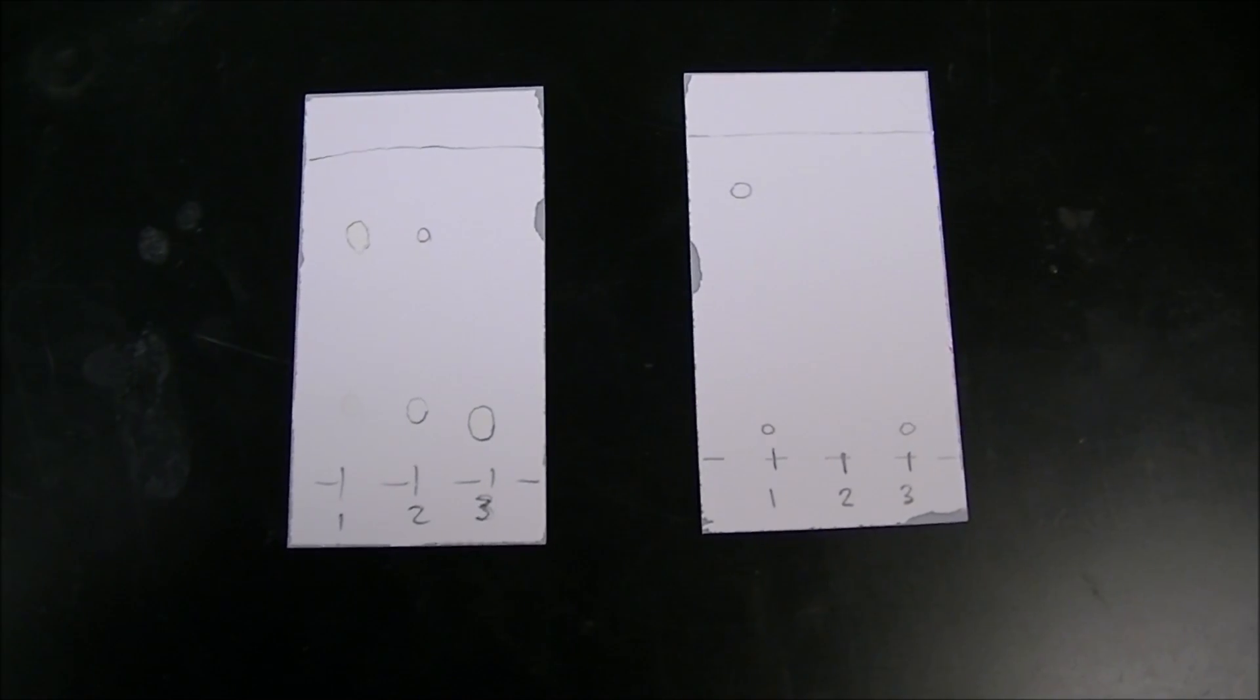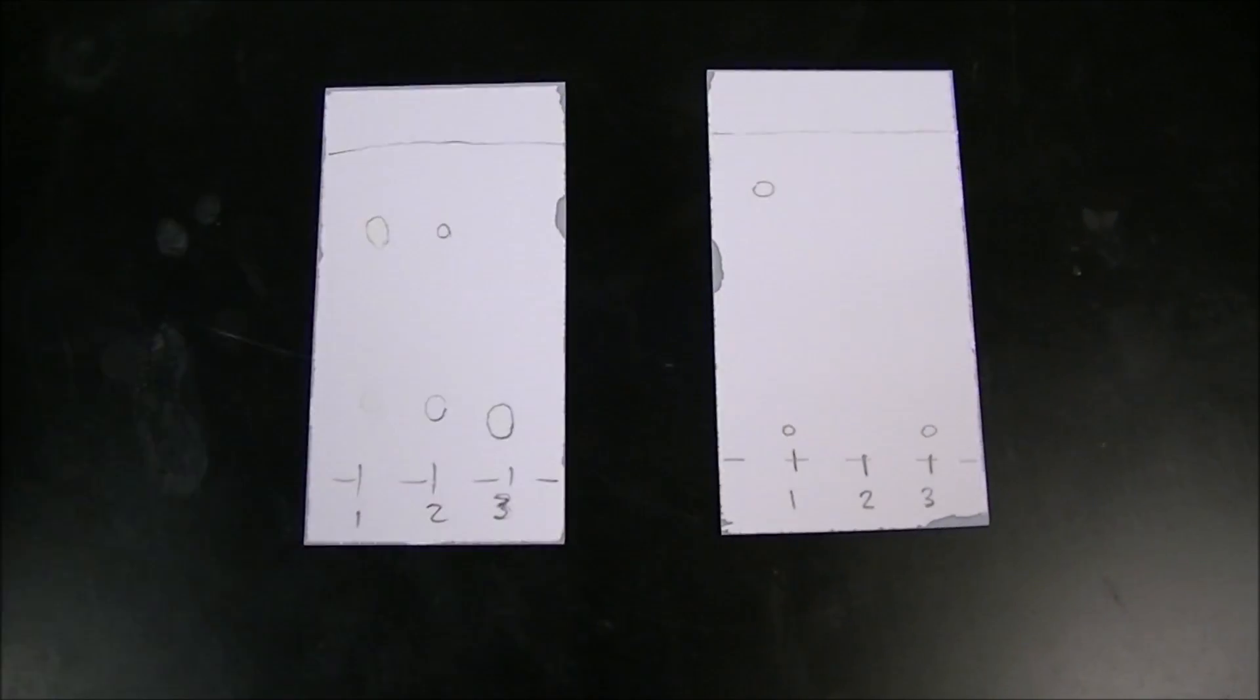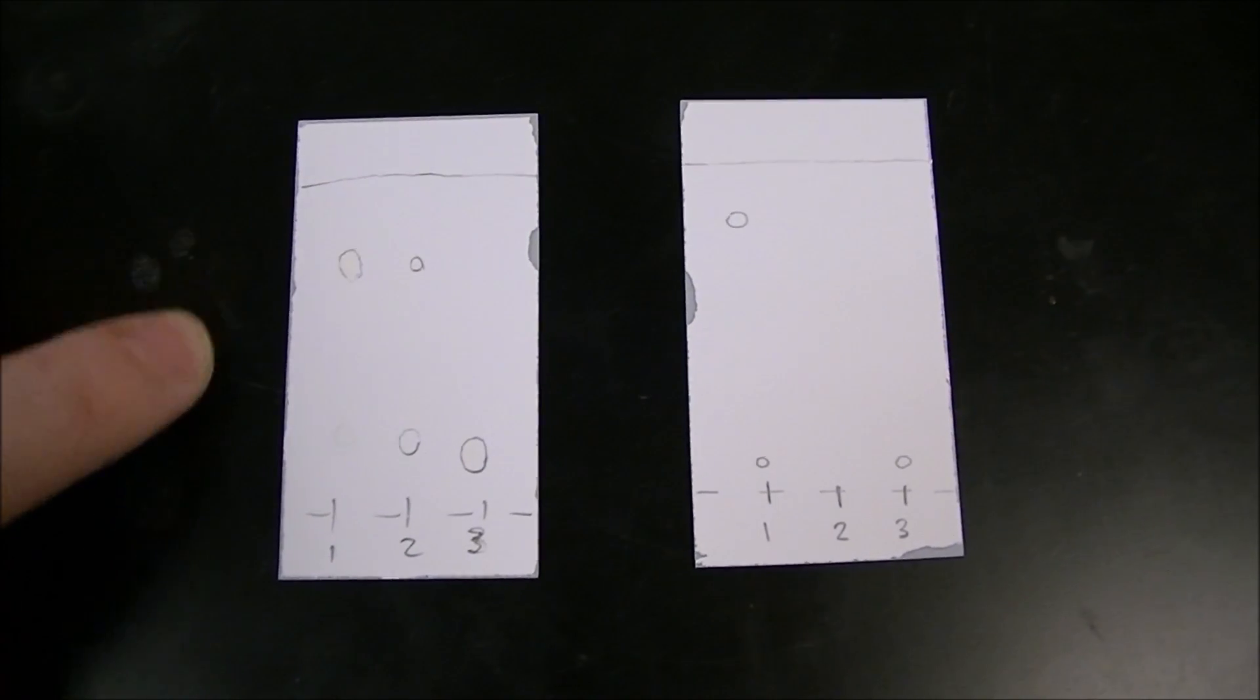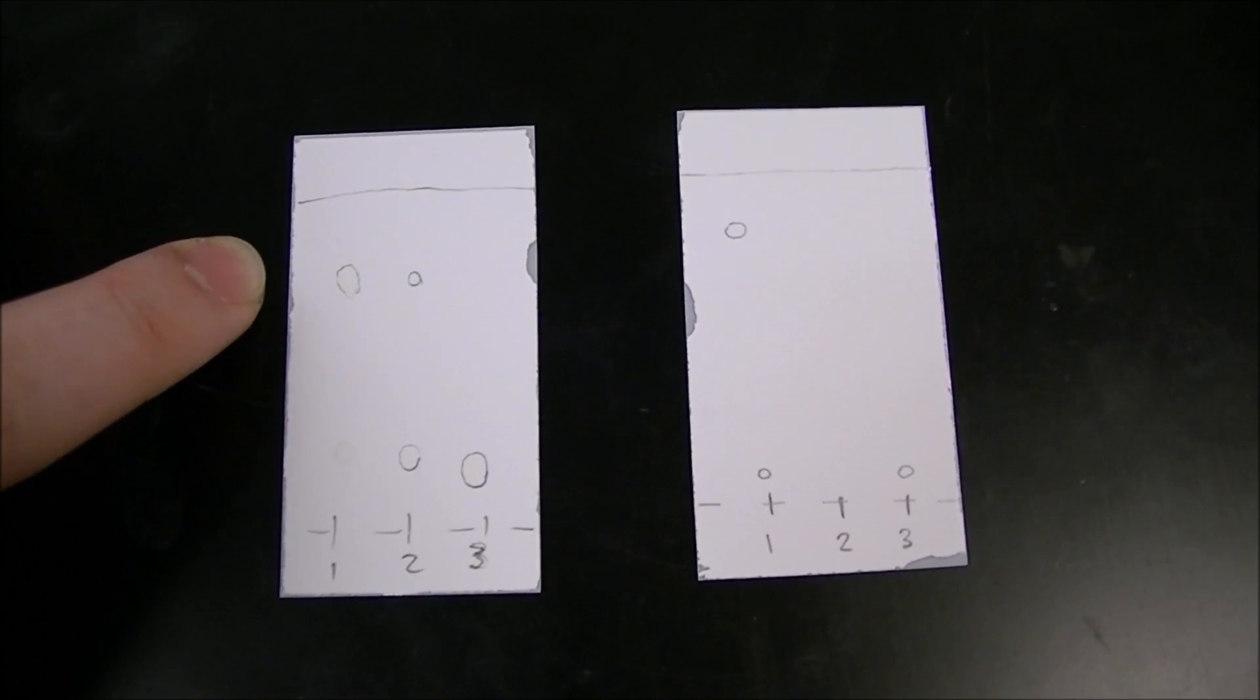We have two TLC plates here from this experiment. The one on the left is ideally what you will get where you have the first lane is basically just the trans isomer. The middle lane is about half and half and the last lane is just the cis isomer.